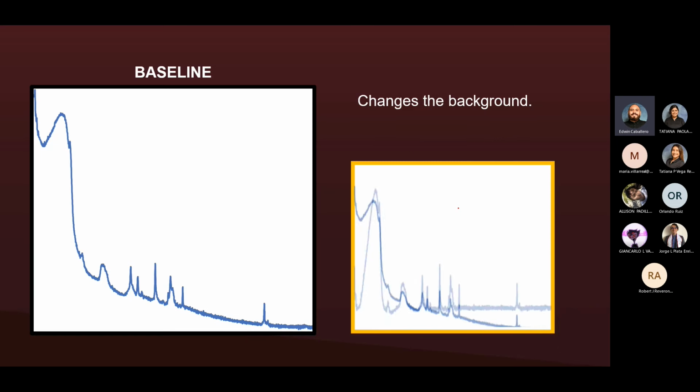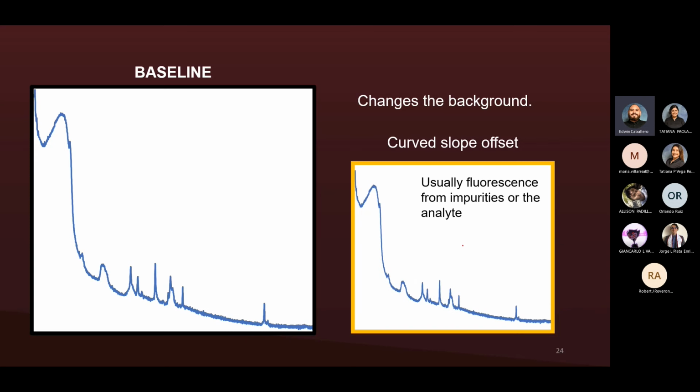when it looks a little bit more curved, we usually chalk it up to what's known as fluorescence. Fluorescence happens when the peaks in the spectra look a lot smaller. So you might see something like this. This is probably a spectrum obtained that contained fluorescence, and fluorescence depends on the specific molecule, or maybe even impurities in your sample might have the fluorescence by themselves.